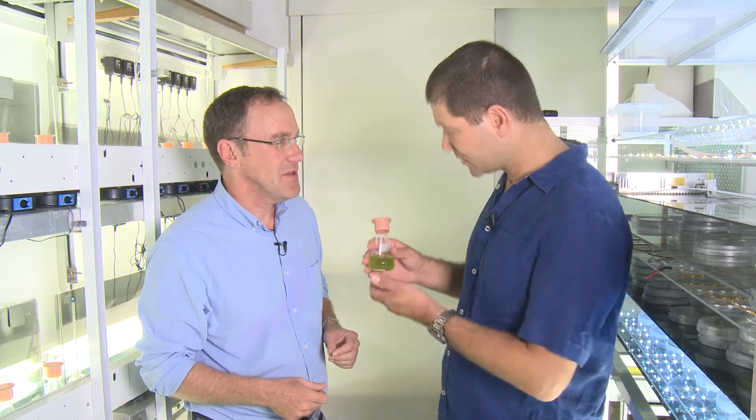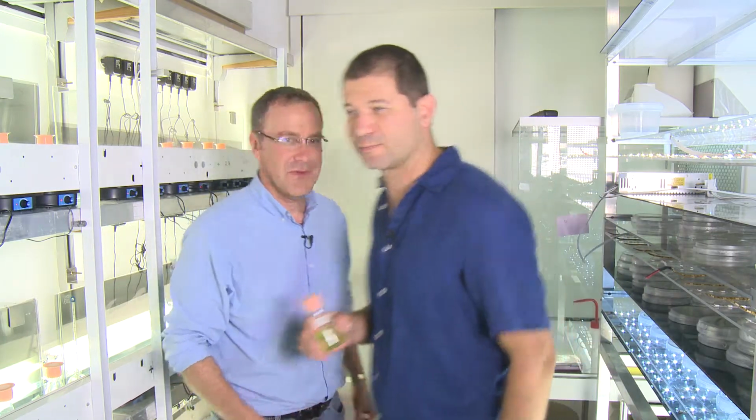So can you show us what type of experiments you do with these organisms? Sure, let's take them upstairs and measure them in our equipment.